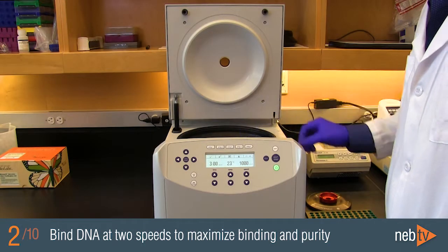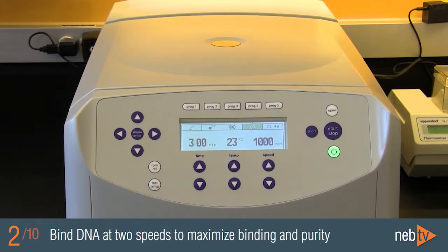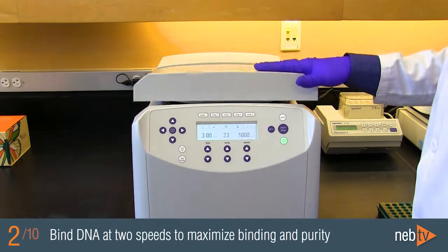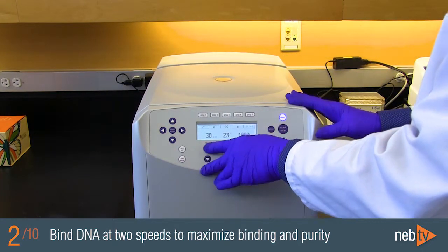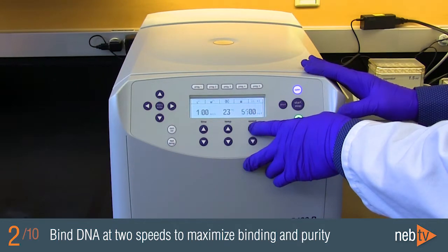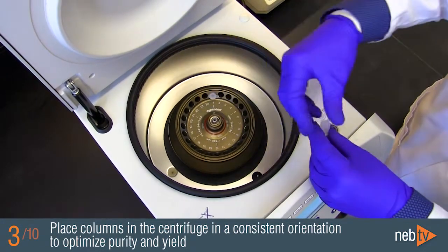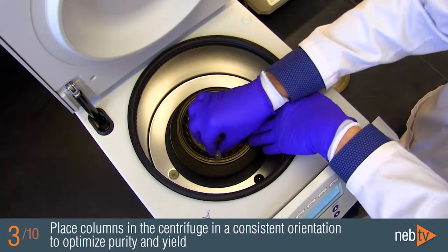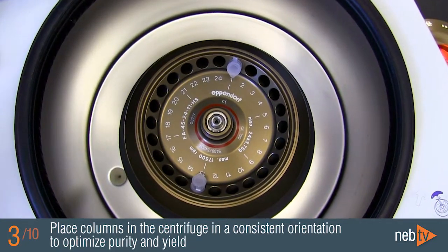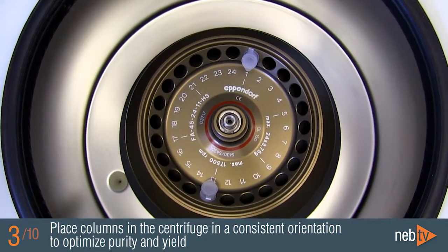The binding step is carried out at two different centrifugation speeds: first at 1000g, and then at maximum speed. Spinning at a low speed gives the DNA more opportunity to bind to the matrix, then spinning at maximum speed clears the membrane of remaining salts and proteins. We recommend that the columns be placed into the centrifuge in the same orientation — for example, with the hinge pointing outward. This ensures the liquid takes the same path during each spin, optimizing purity and improving yields by around 5-10%.